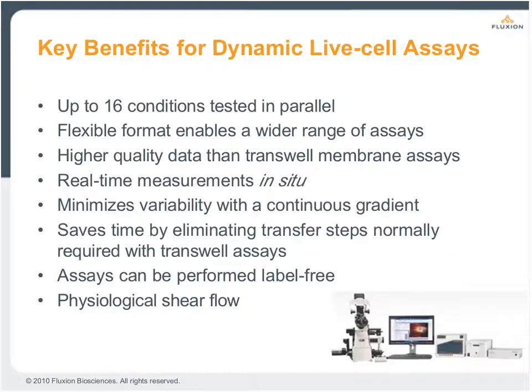The advantages of using the BioFlux system are that data from several conditions can be captured at once in time-lapse, so you could do many migration or chemotaxis assays in parallel. You can use one system to study all of these different things, both the fluid-fluid setup or the fluid-solid setup where we did invasion. Data capture is only limited to the limits of what your microscope can do, so you don't have to do any kind of handling. You're really doing everything inside the channel.